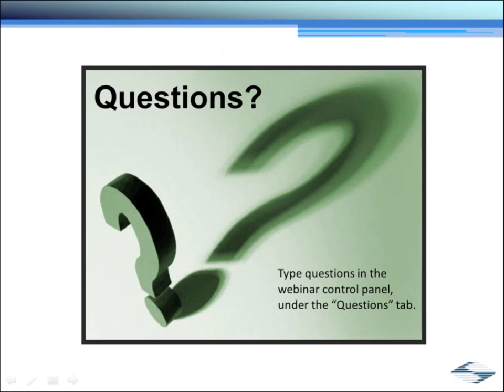So the first question is, this user wants to use a MOM for 2-photon FRAP. I want to photo bleach a small volume for only a very short time at high laser power. Is there a mode to photo bleach only a small volume at high laser power and rapidly change to normal laser intensity? And one of the complications the user indicates is that they only want to use one Ti-Sapphire laser and one Pockel cell to do this.